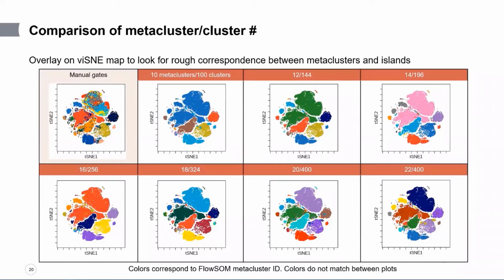And if we consider the panel used here, there were markers for every major lineage found in the peripheral blood, so we do expect to be able to identify a large number of populations. And with this workflow, you can check your results visually to make sure they're logical to you and consistent with your prior knowledge, and that you're not just blindly trusting the algorithm.